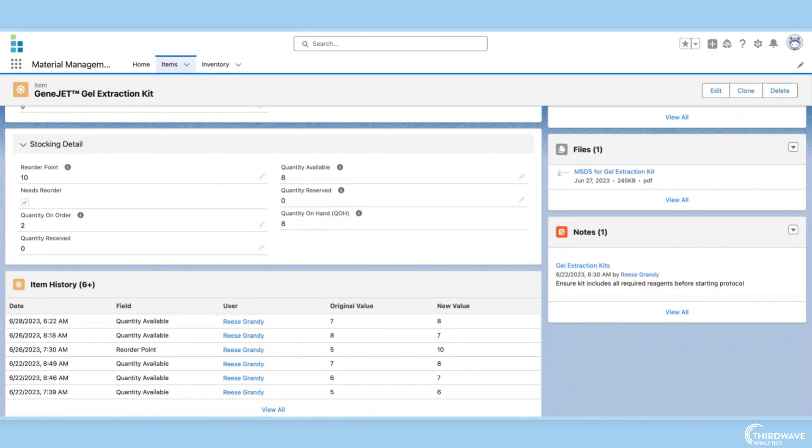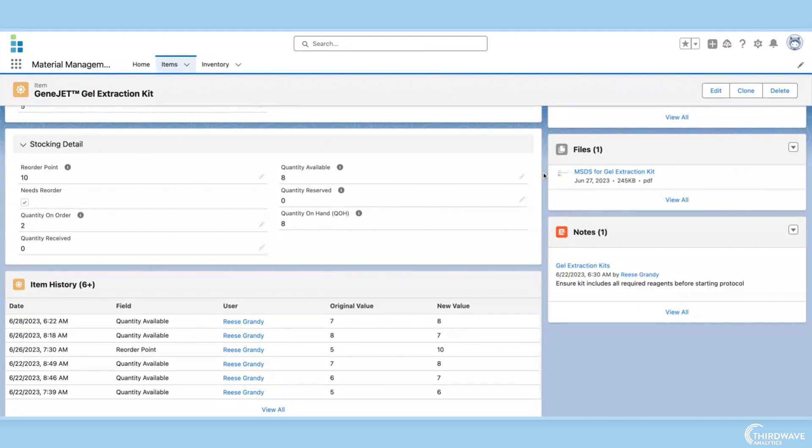These notifications are automated in Lockbox, so when the quantity on hand falls below the reorder point, a needs reorder flag will appear on the item record page. The lab's purchasing manager will also receive an email notification reminding them to reorder the item.